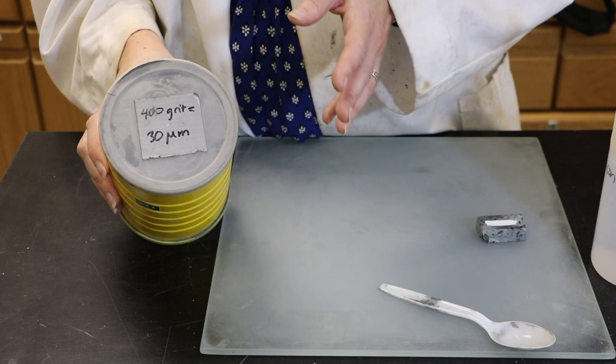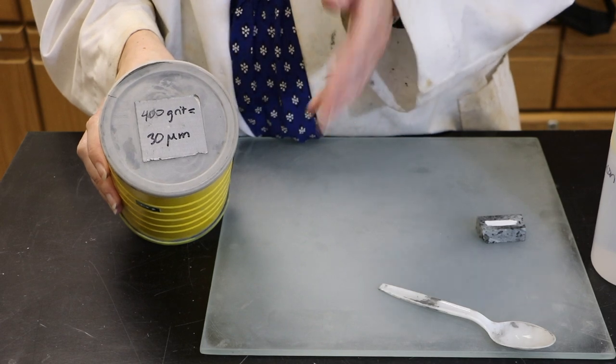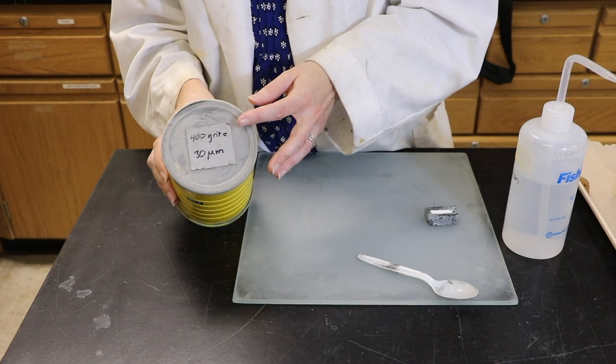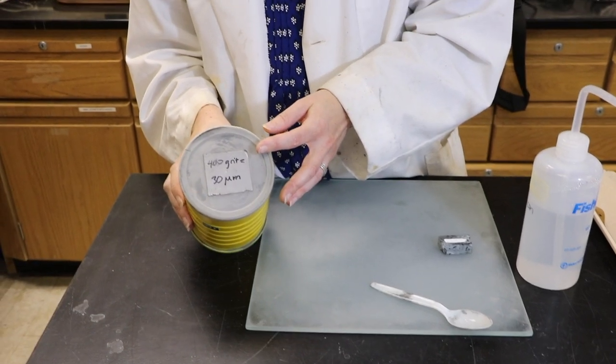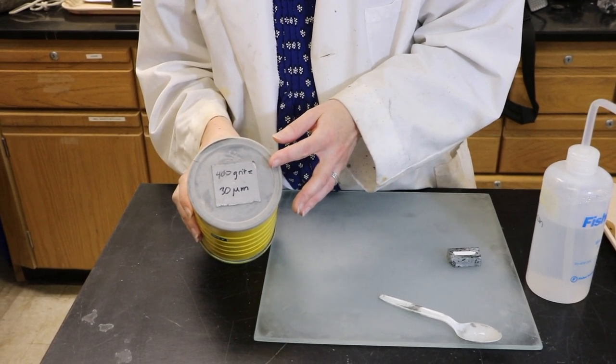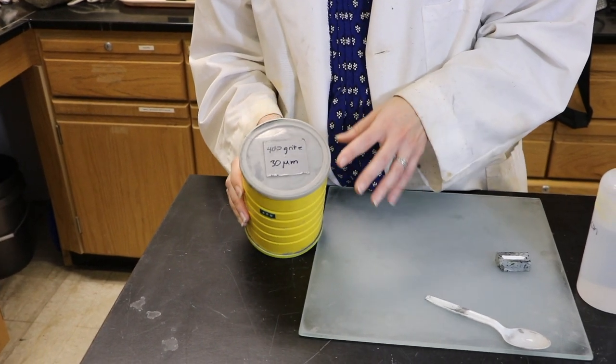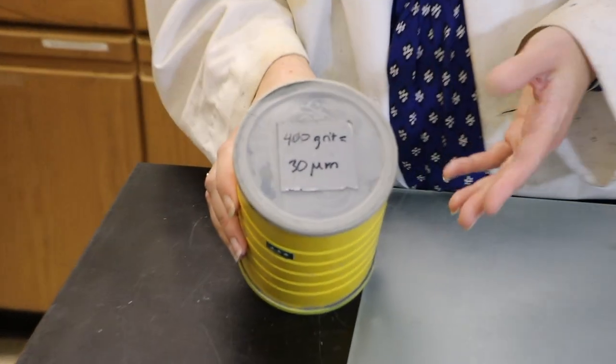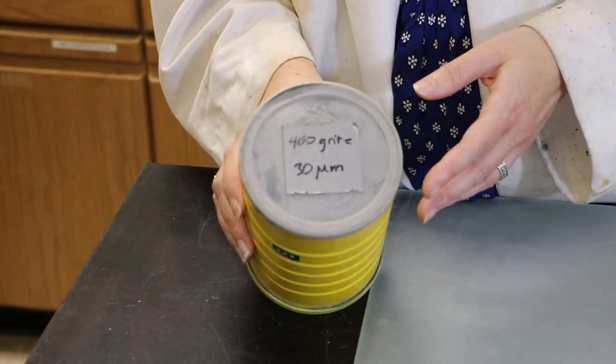With grit size, the numbers actually go in the opposite direction from coarser to finer. This is 400 grit at 30 micron size, whereas 15 micrometers is actually 600 grit. Just keep in mind the size of the particles you're actually using to polish with.